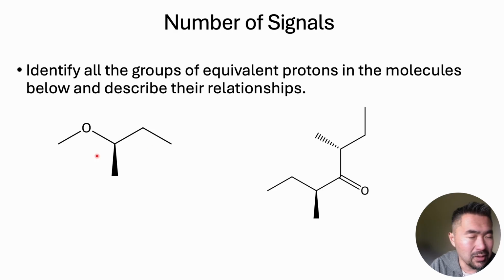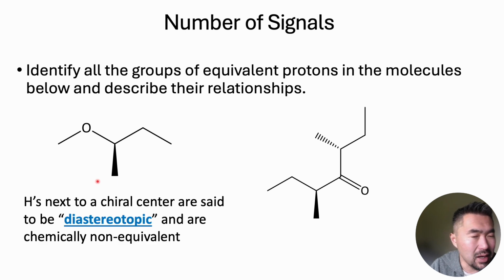And what I might do with you right now is go over this molecule during class. Maybe we'll practice on this molecule together. Now, this molecule, hope it makes sense that these 3 protons here on this methyl are equivalent, so that's one signal. There's one proton here, so that's the second signal. And then this methyl is different than these other methyl groups, so that's the third signal.